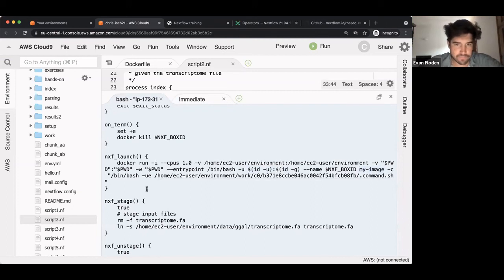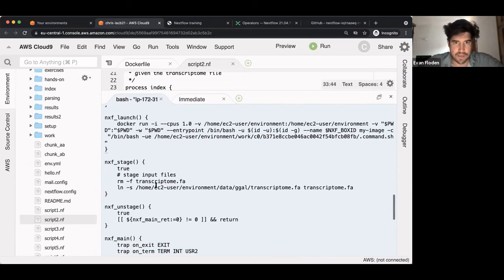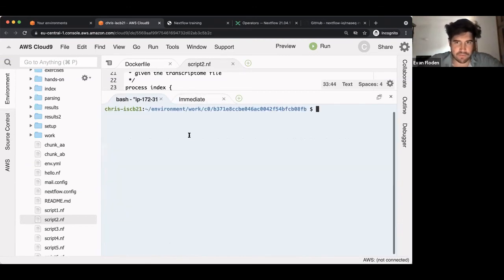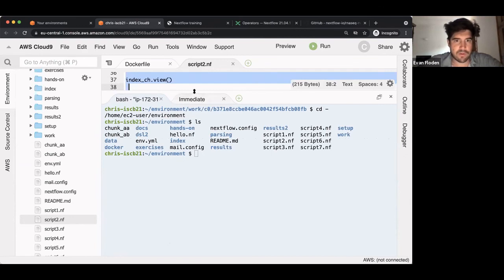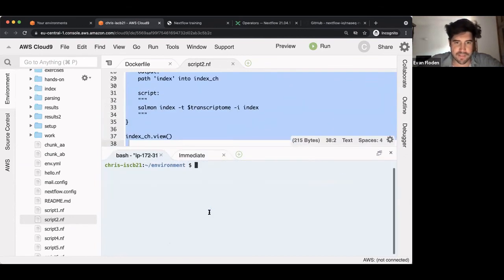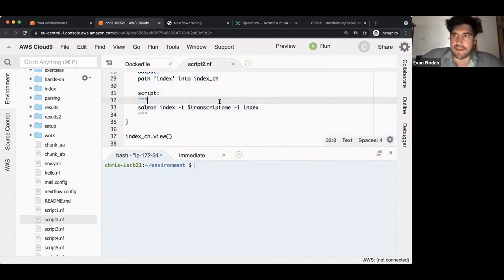Okay, so that's just a little bit of a deeper dive into it. But for most purposes, we can just remember, specify with Docker or Docker enabled and point it to the container that we want. The very, very last thing: how would I recommend that you do this in practice and what does that look like in real life?